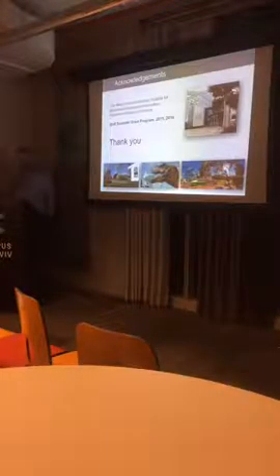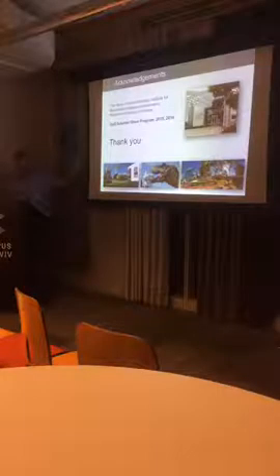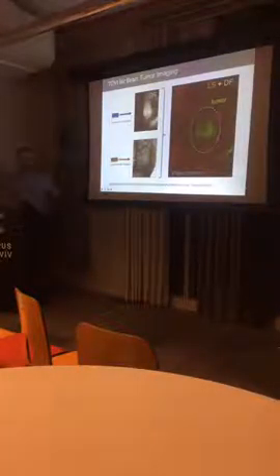Your question about the combination of speckles and fluorescence, I showed it, but I can show again. Because we're already over time, I won't go into detail, but I have many publications where I specifically combine them. This is just one example.